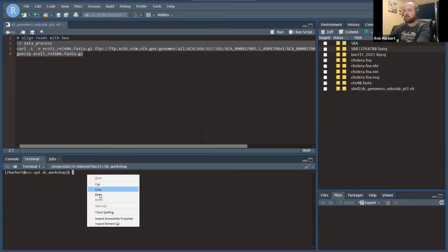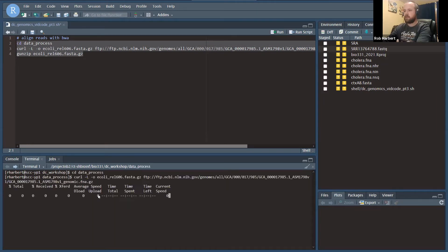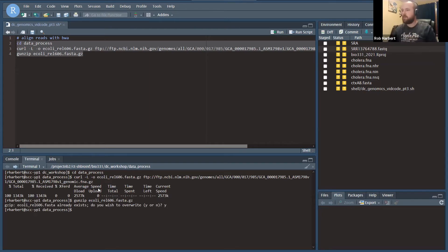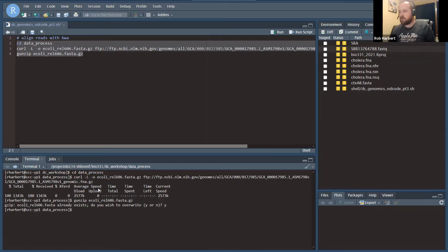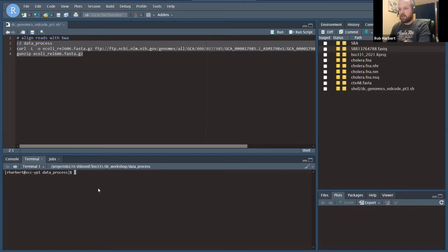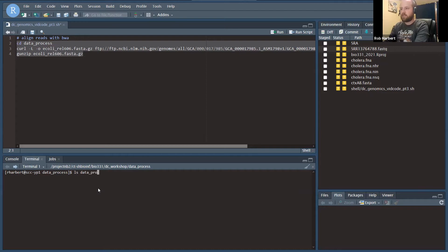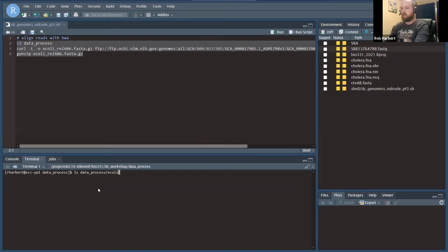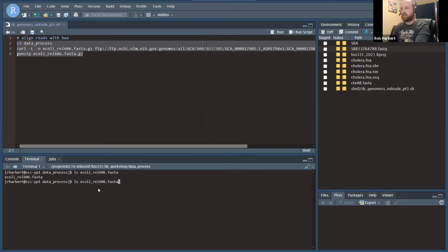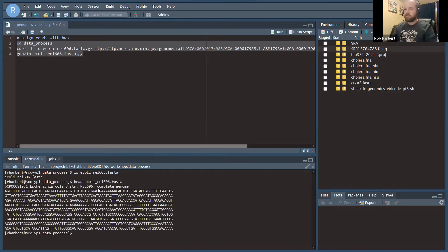Let's run that. I did this earlier, so we'll do cookbook or cooking show style here and just do it again. Now if we look in data process for something named E. coli, we have that file and we could look at it just to make sure.